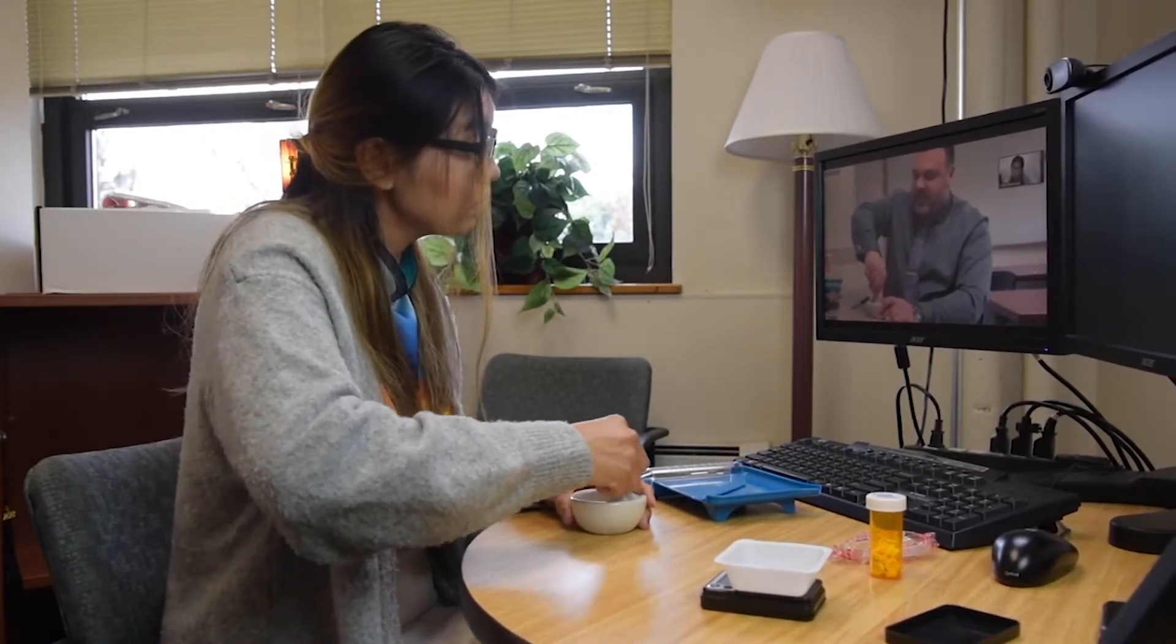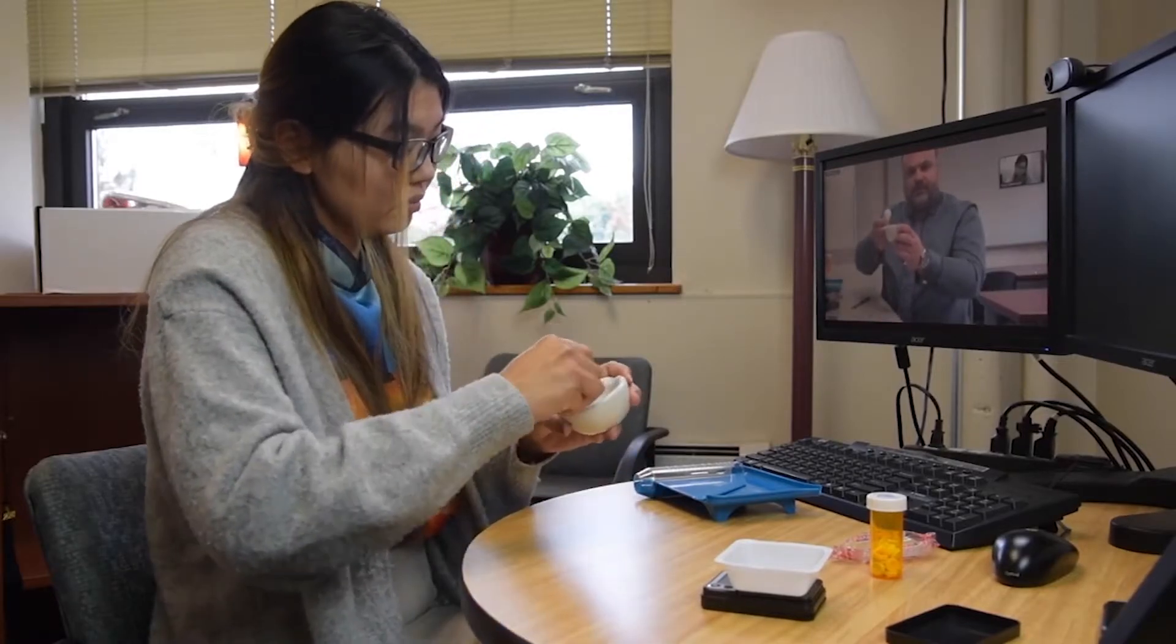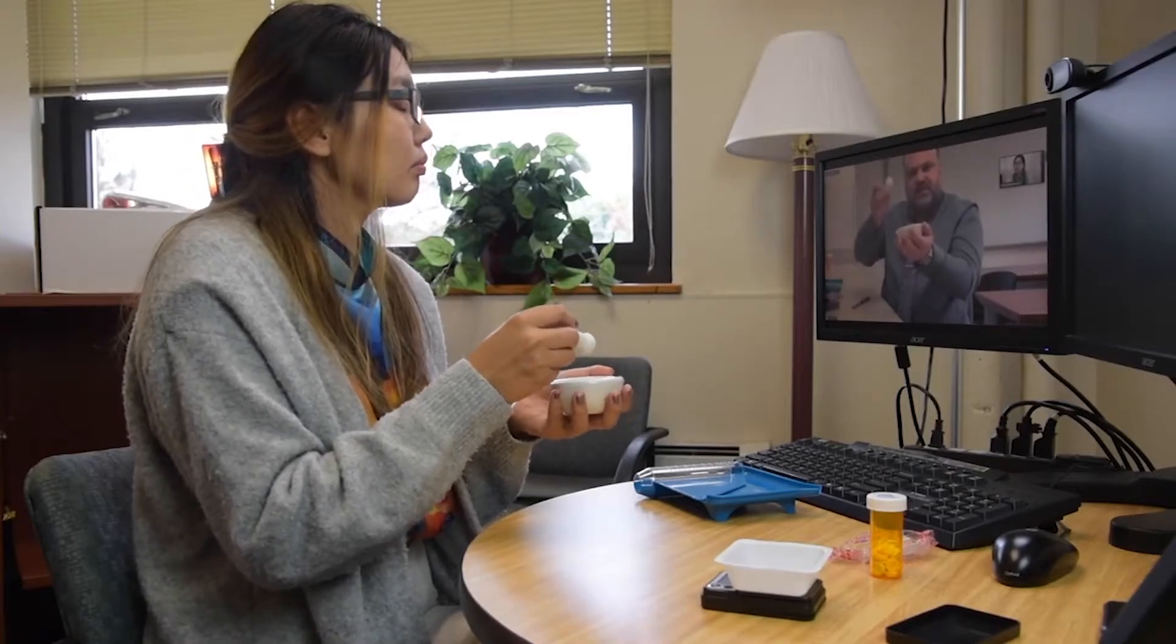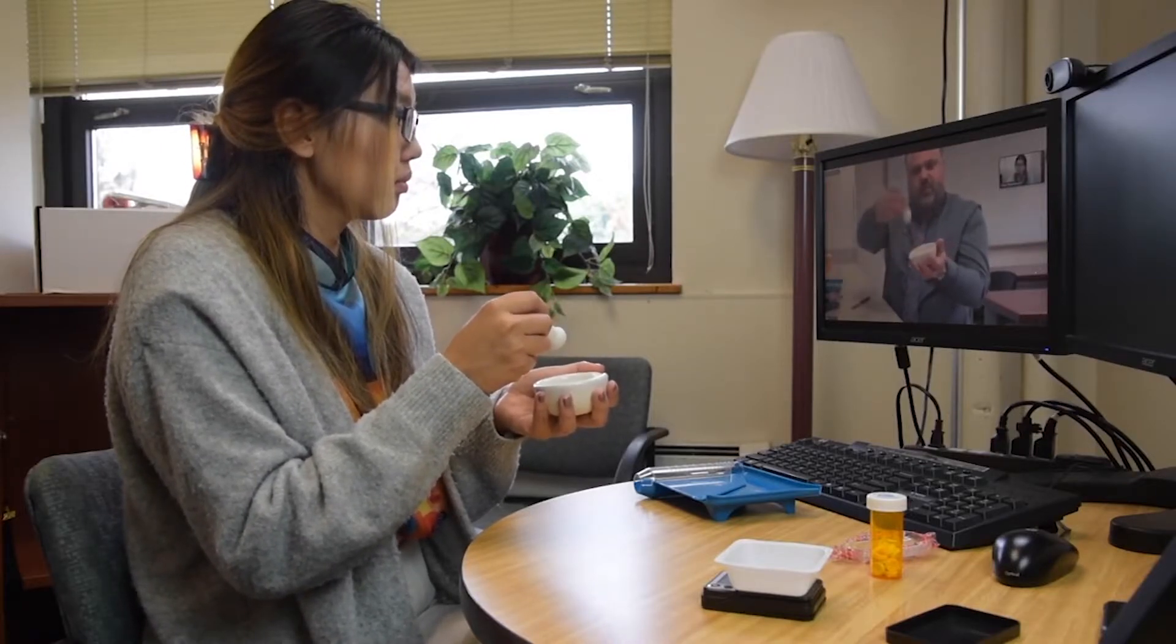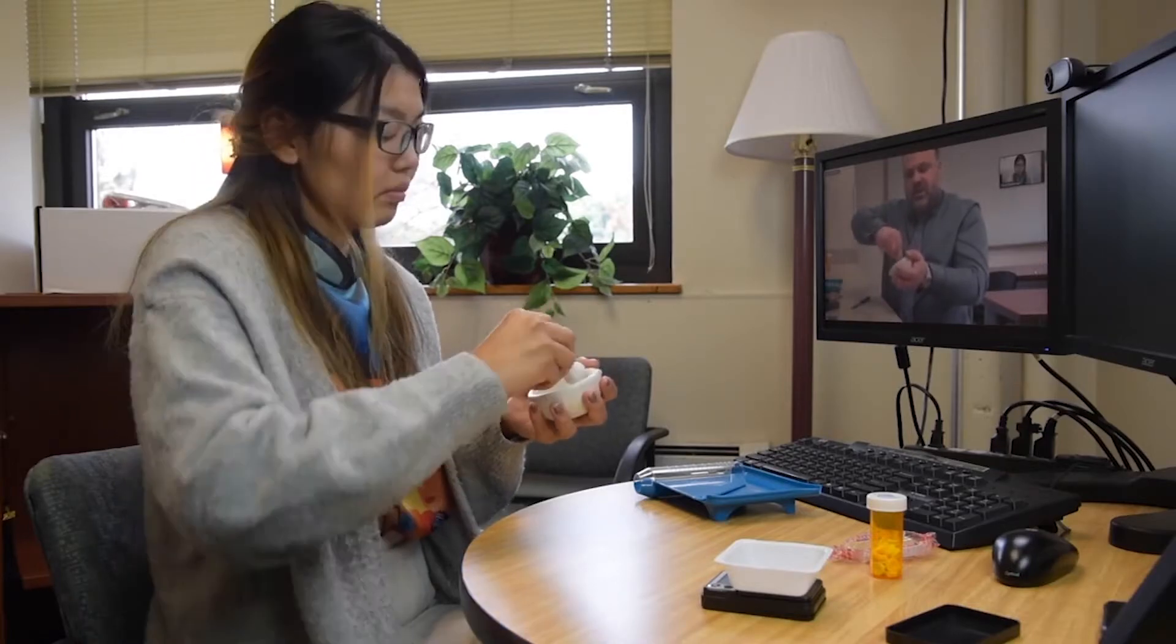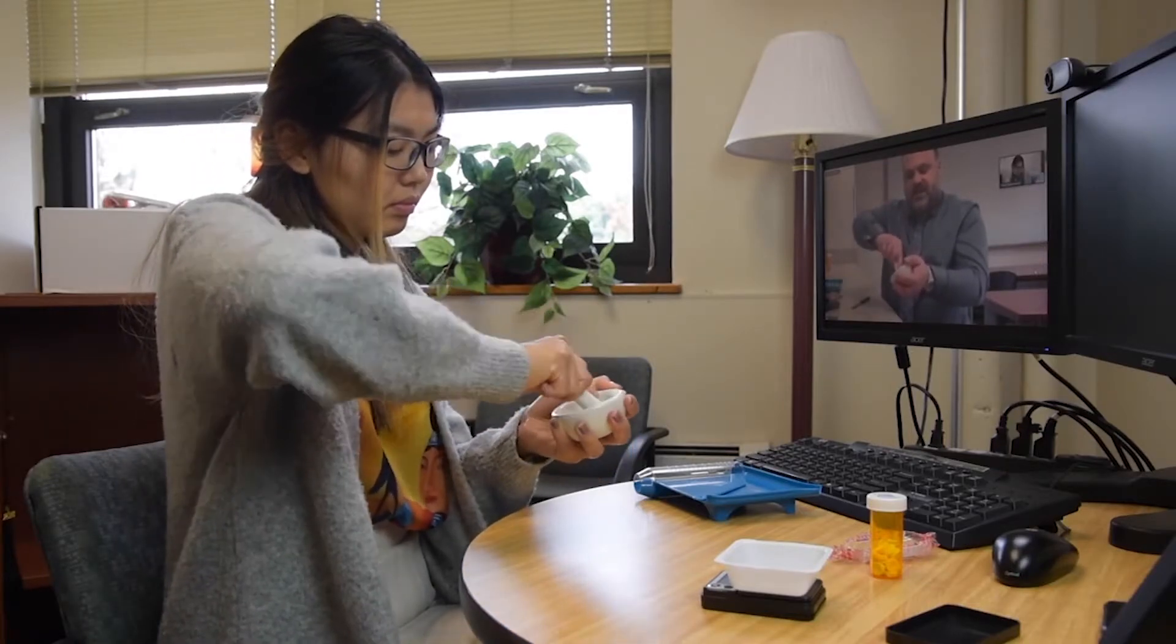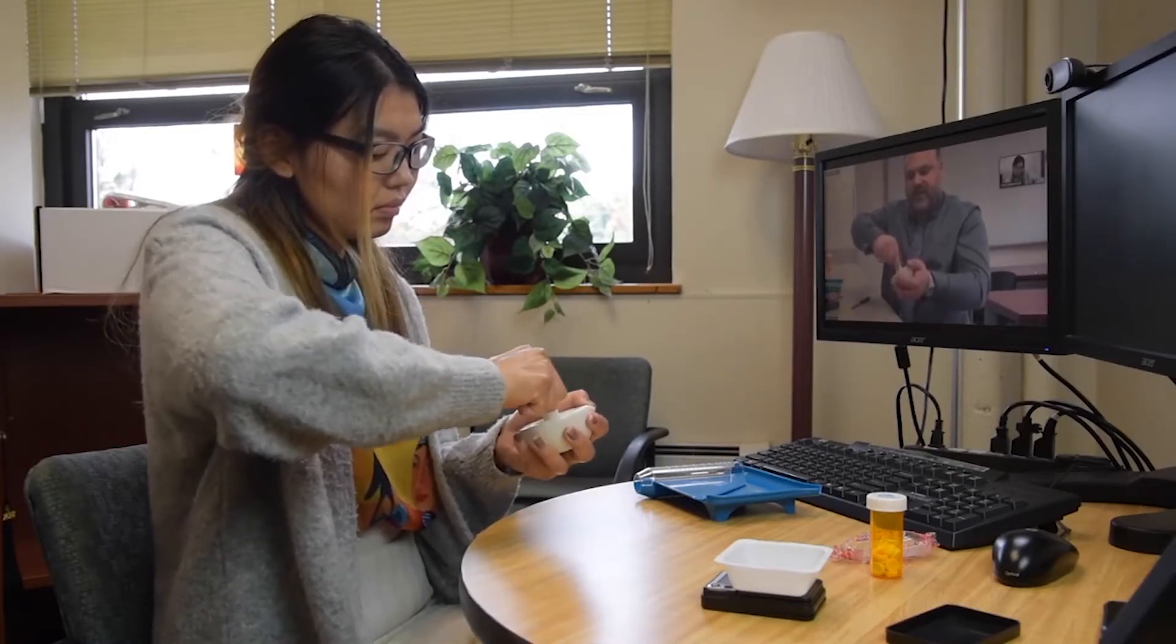Once you have them all broken down, you want to take the mortar into your non-dominant hand, the pestle into your dominant hand. And you'll want to use the curvature of the pestle into the curvature of the mortar on the side to use a scraping motion to get all the large particles that remain into a very fine powder.